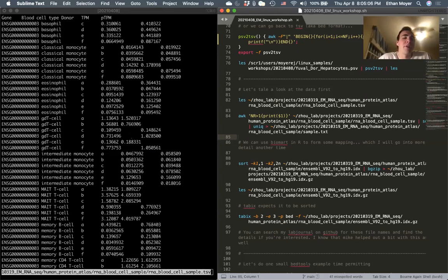And for each row, you can see that we have an Ensembl ID, the corresponding cell type it's taking a measurement of, and then column 3 specifies replicates.